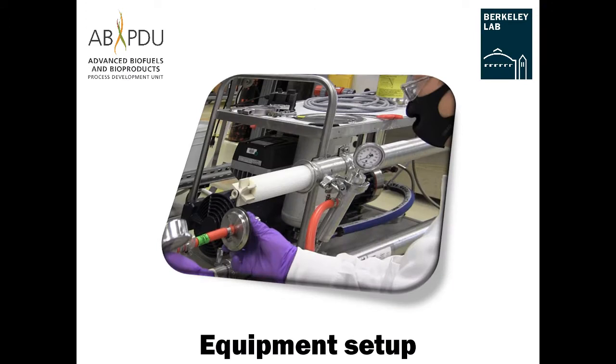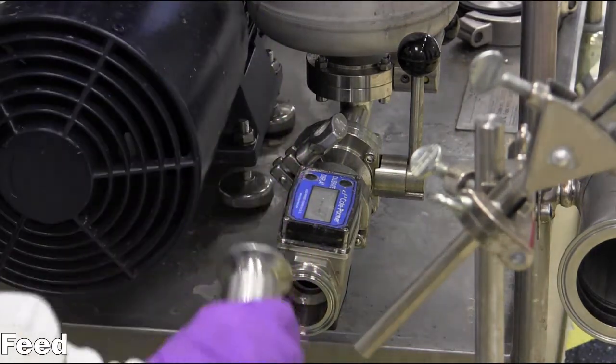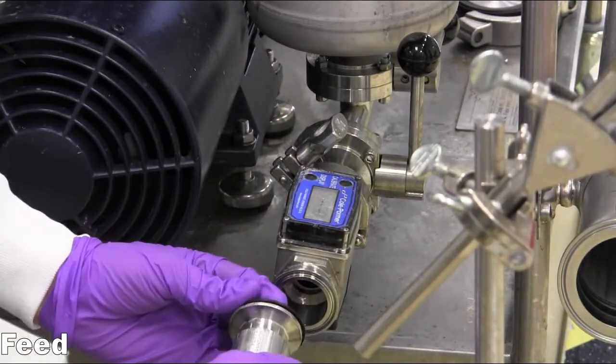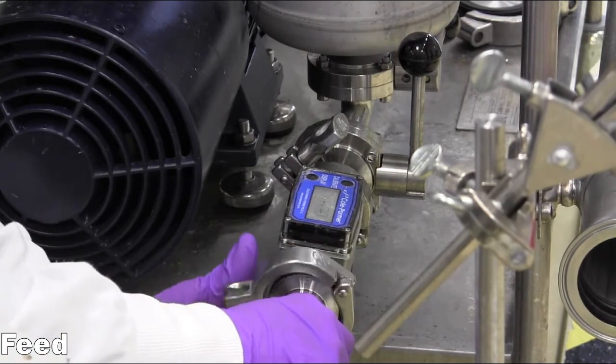Equipment setup: A hose is connected to the digital flow meter attached to the feed inlet port below the small feed tank via a sanitary tri-clamp connection.